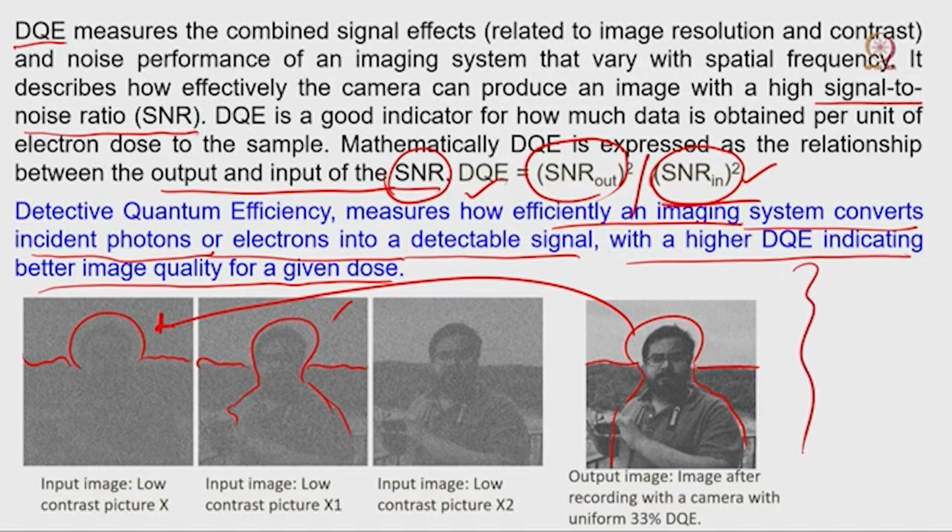We will discuss all of this image formation, and how we get these noisy images in the TEM. If we use a model on those kinds of noisy images, it can give us a biased model reconstruction, which we will discuss more. But the take home message for today's class is that a high signal to noise ratio is very much required to get good contrast and good images, which will help us in the future for the 3D reconstruction. We will discuss this imaging part in the next class. Thank you all for your attention.